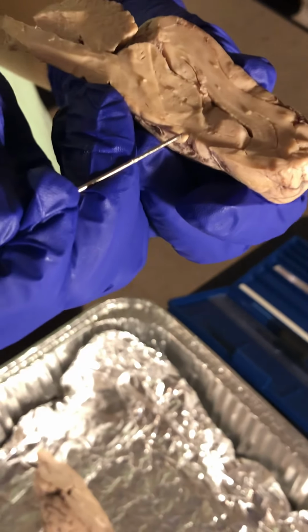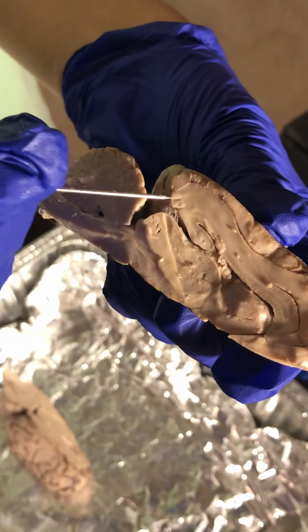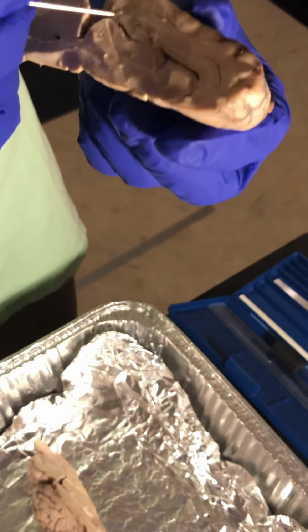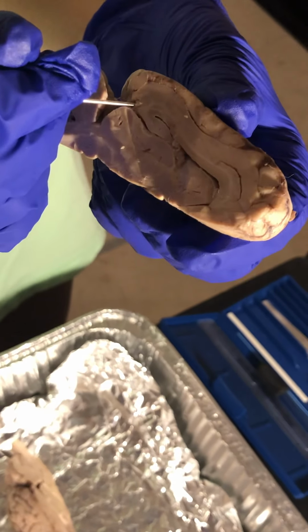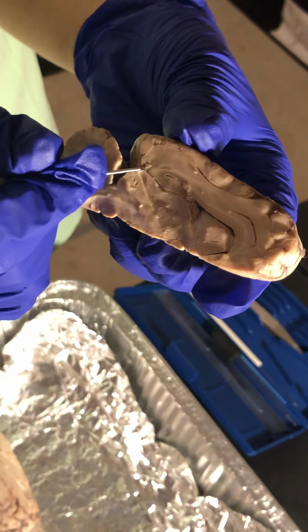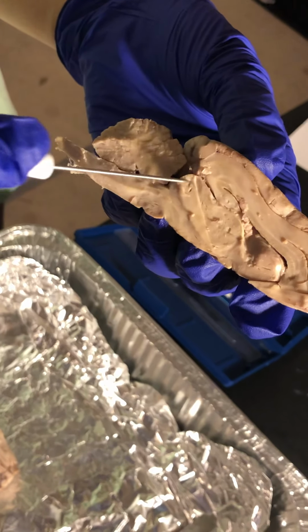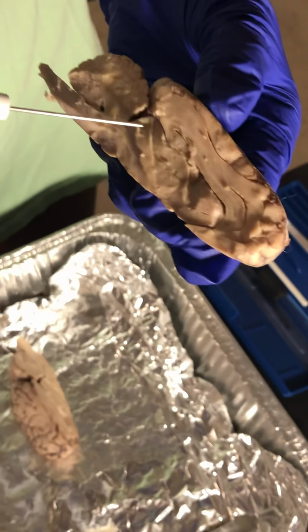Then we have the pineal gland, which is right up here. You can barely see it, but it's really tiny and I'm pointing at it. And this is an endocrine gland that secretes melatonin hormone, and this is what plays a role in sleep, aging, and the reproductive system. Then lastly, we have the superior colliculus, which is right below it, and it's this part I'm pointing at. And this is what tracks and localizes objects with the eyes.